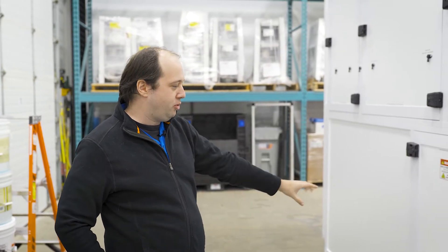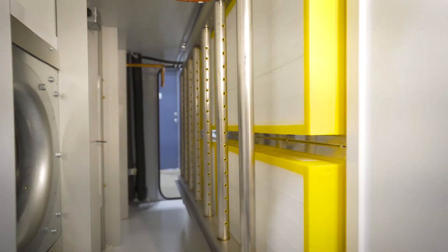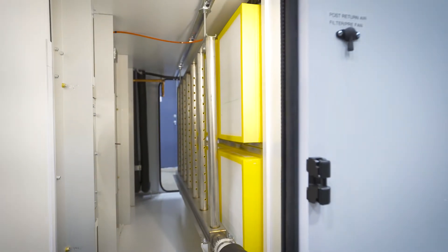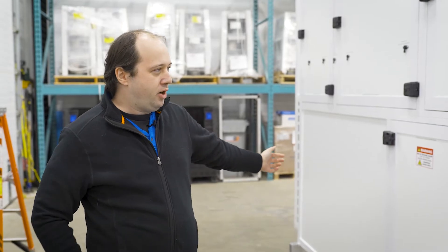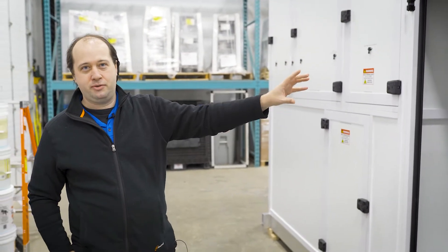And then down below we're bringing in return air from below using the humidifier to add some humidity if it's required. And then all of that gets mixed together here in the mixing section before it gets split into the three zones.